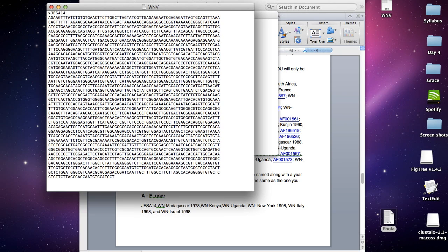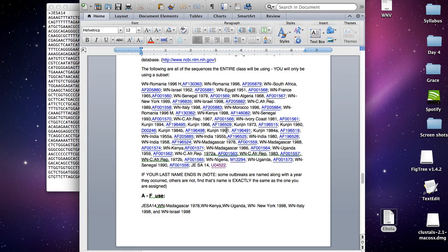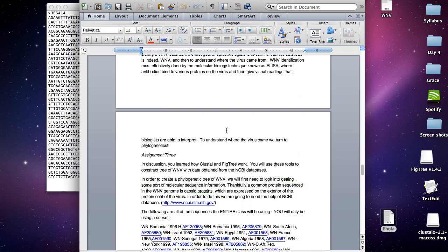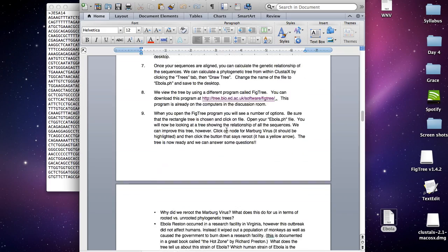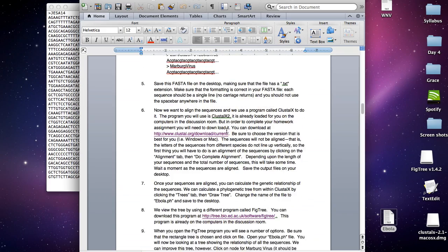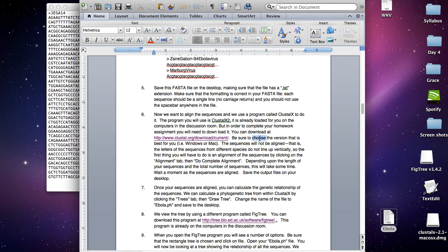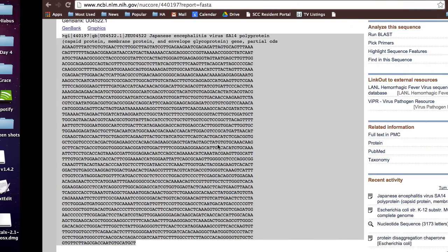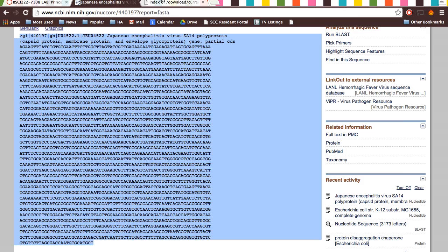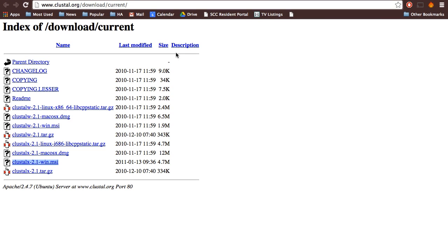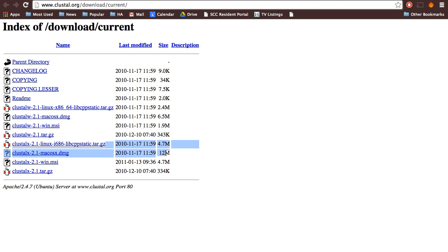The next thing you want to do is align your sequences using ClustalX. You can download ClustalX at home by clicking on this link, and it'll bring you to this page right here. There are a lot of different links, so it's kind of confusing. If you have a Mac, you want to download this one—it's the larger file. If you have Windows, download this one—it's the larger file compared to this one.